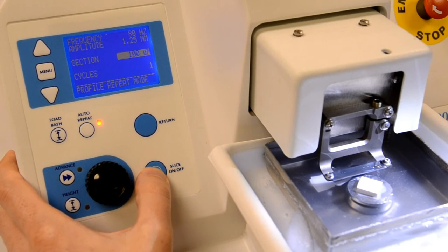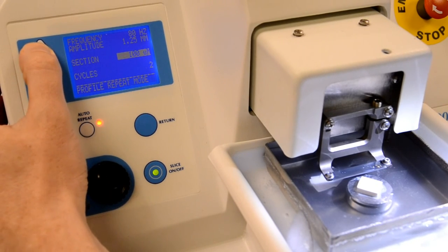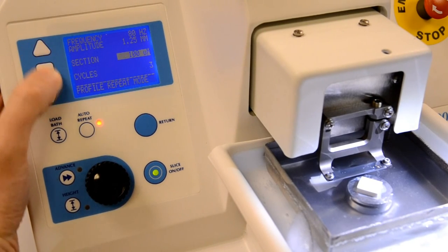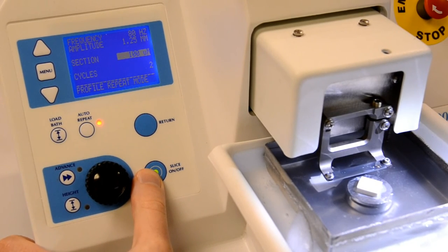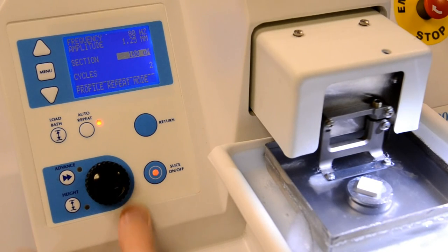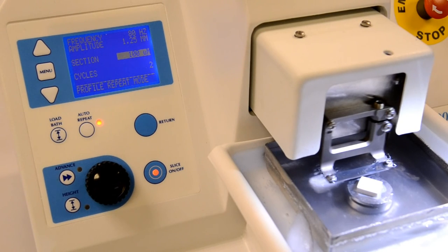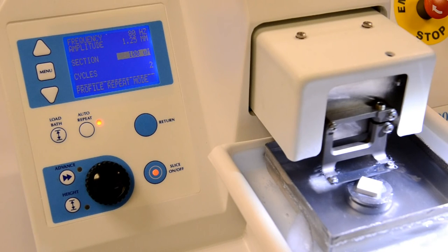To enable this, press the auto-repeat key twice and the display will change to the profile repeat mode where you are invited to input the number of cuts to be taken. Use the arrow keys to input the number of cutting cycles. Once you have set the number required, press the slice on-off key and the instrument will cut the number of slices required using the same speed profile that you used originally.